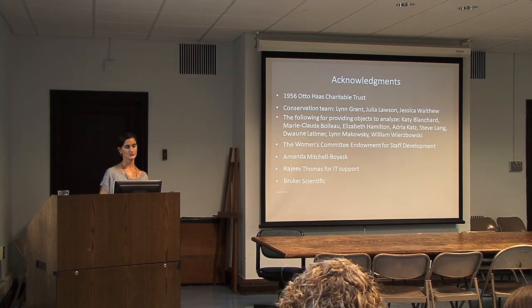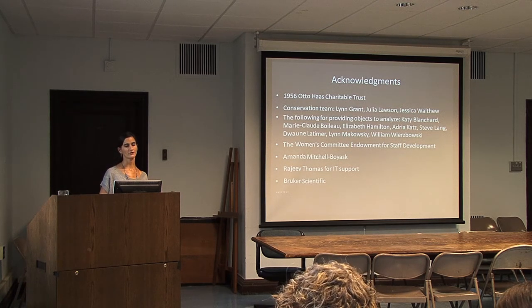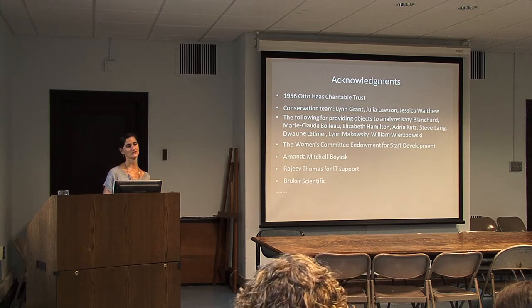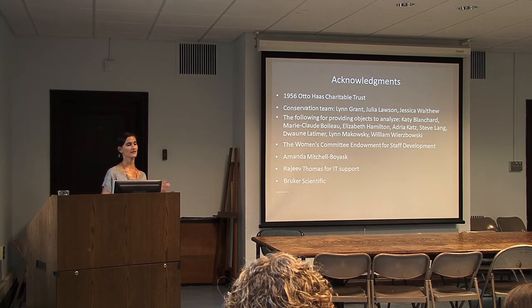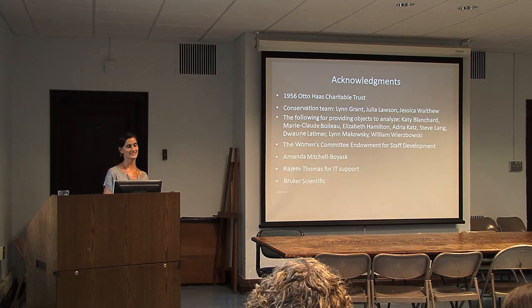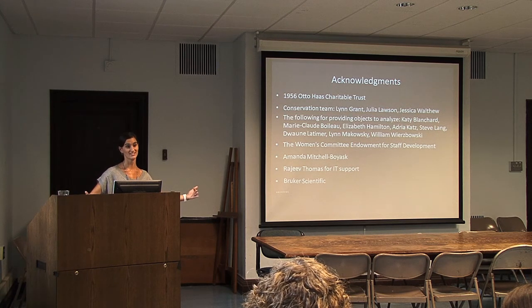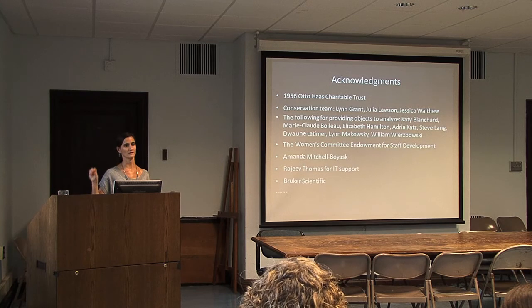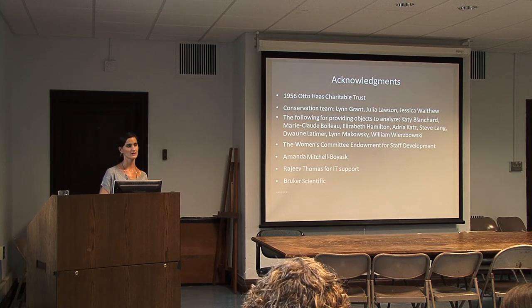Well, I've been storing the files right now just separately, but I've been trying to write reports on what it is that I have found and put at least the screenshot of the spectrum, because the spectrum is the data that you can then use to extrapolate further conclusions. So yeah, I've been attaching those records as documents in the multimedia module, and then attaching them to the individual collection modules.